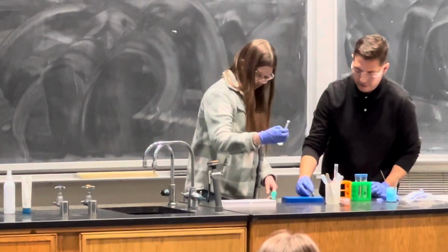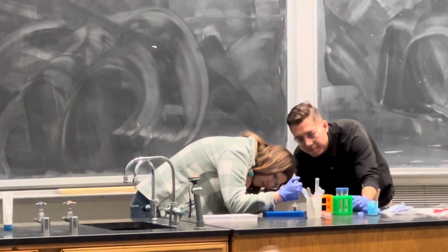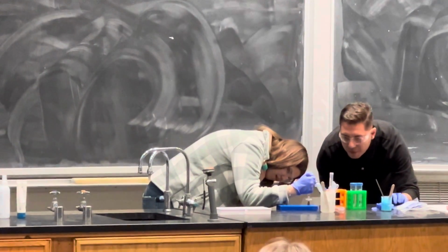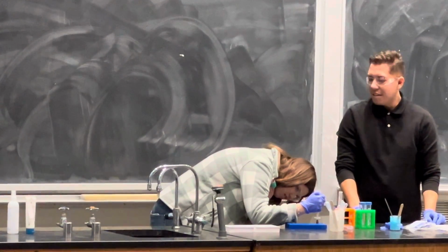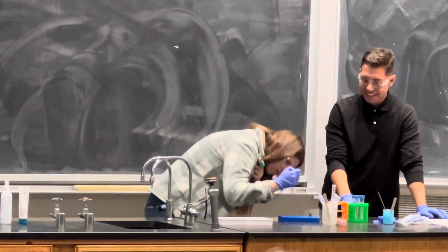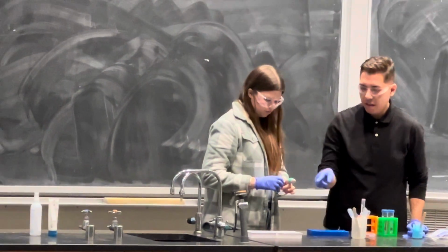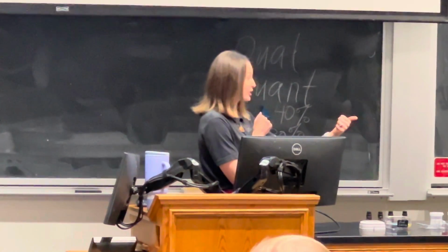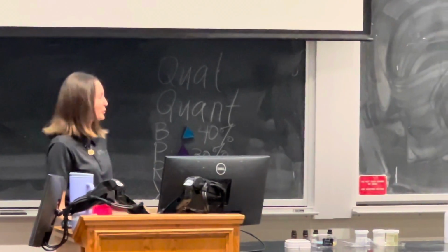And then you're going to put it in your vial. Just put everything on top. Everything, yeah. There we go. Sometimes the filters are a little clogged. They're doing their job, because they're getting all that junk that would be clogging up all of the little small tubes and your analytical column. That is what you use to determine what pore size you want for your filters. It's getting all of that junk out so it doesn't clog up your system. Because that is not fun. We'd rather do it before we put it onto the analytical system rather than doing all that troubleshooting later.